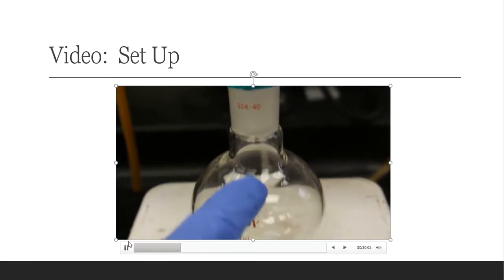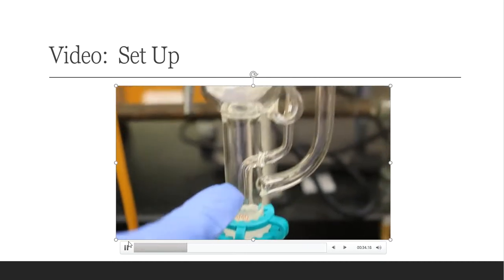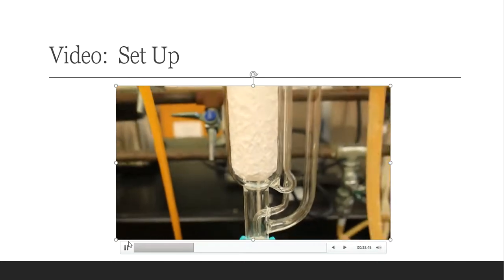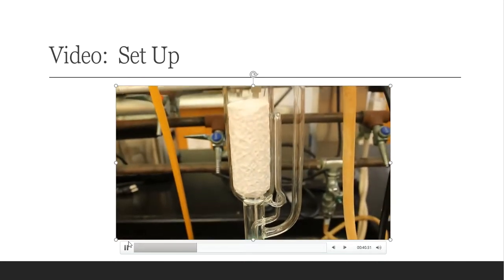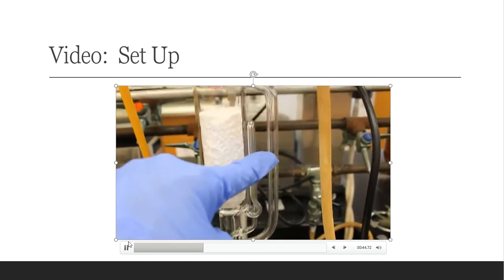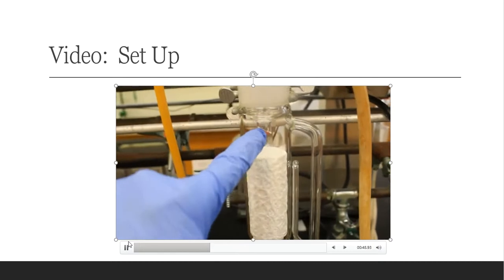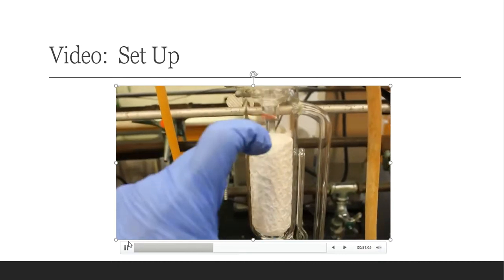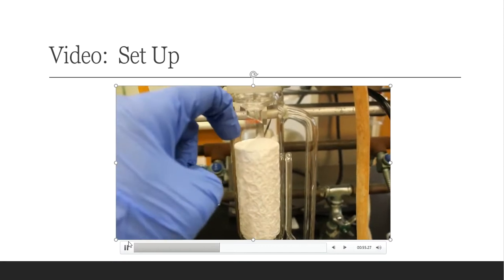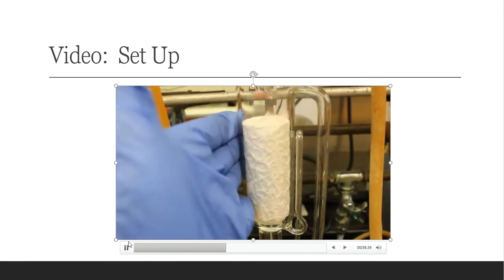As this solvent heats up, it's going to go up through the neck of the Florence flask, and it's going to come into the actual Soxhlet extractor, which is what's next. All right, so the vapors are going to travel up through the neck and back into this area of the Soxhlet extractor. In this area is my thimble. This will hold my peanuts and a piece of cotton at the top. It's already in my Soxhlet, so it's ready to go.